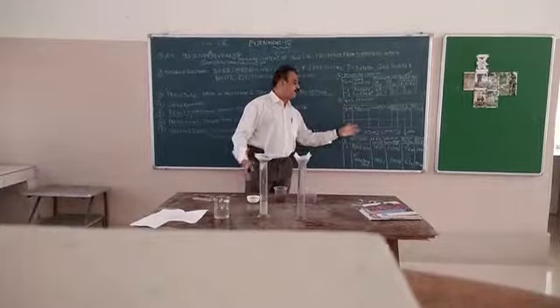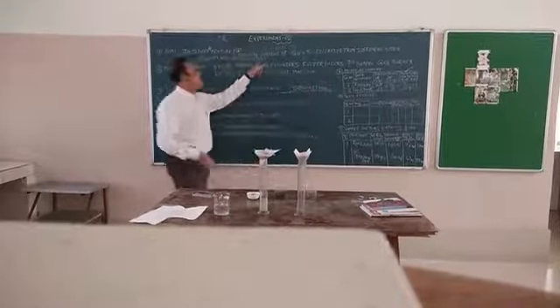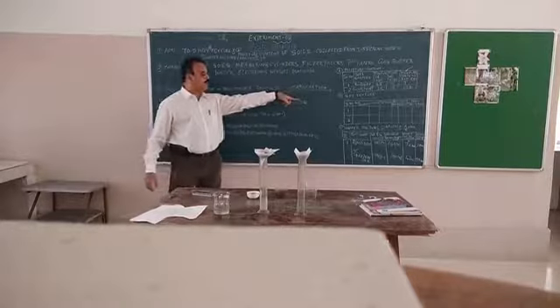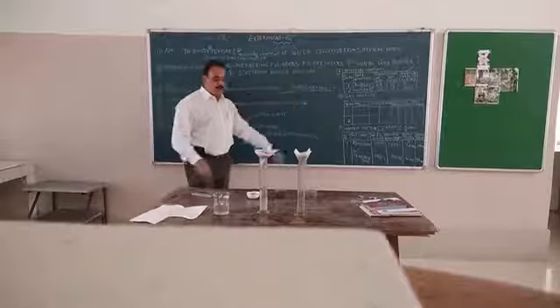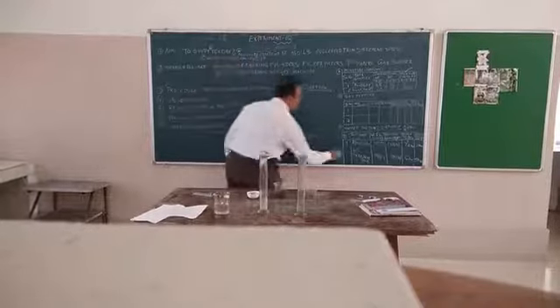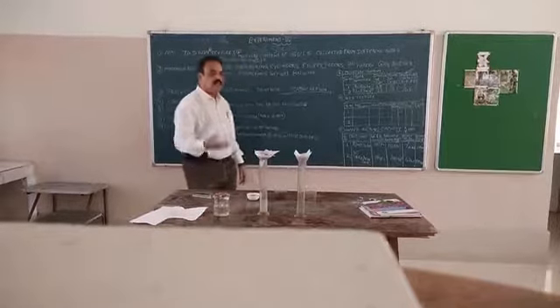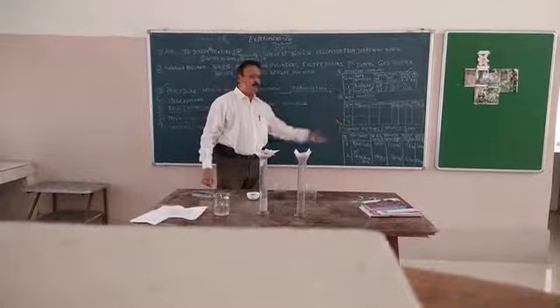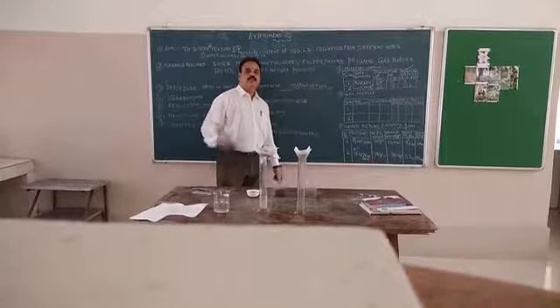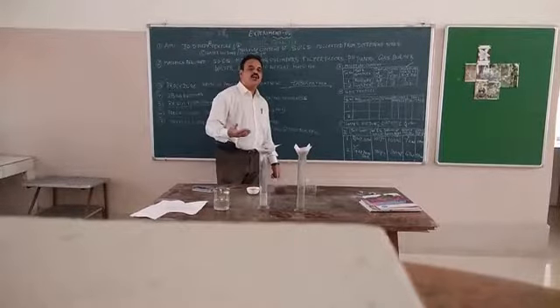Without minerals, soil cannot be fertile. Hence, pH also can be tested. That also you can put in tabular form: serial numbers 1 and 2, then type of soil, either roadside or garden soil water, and the pH value.